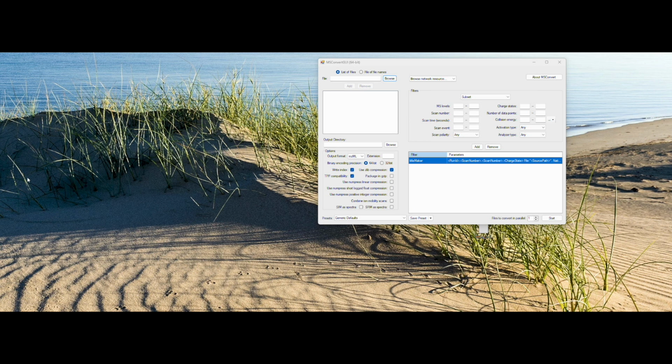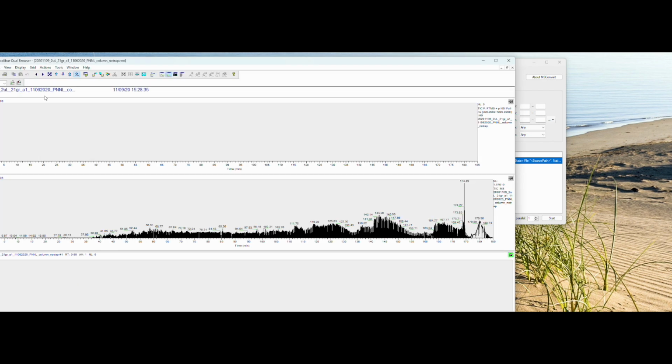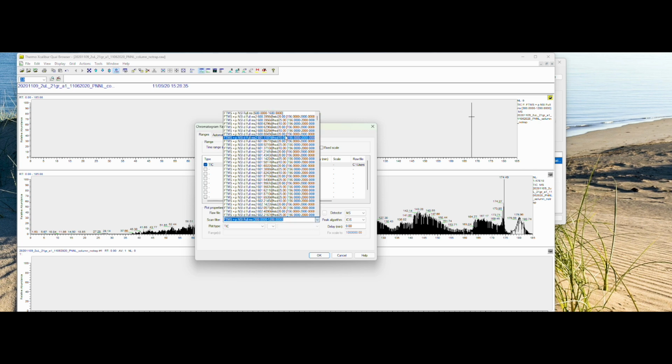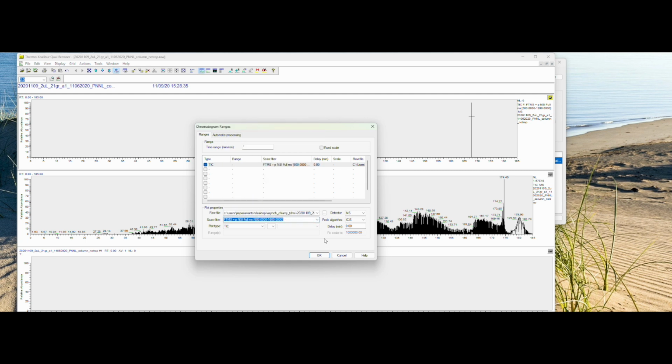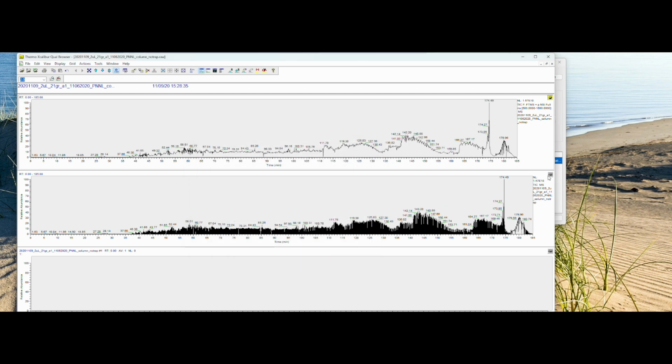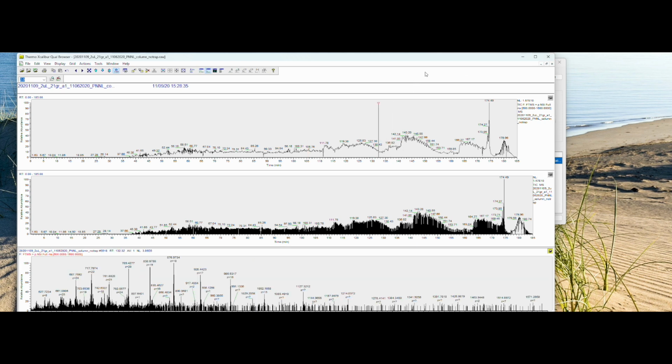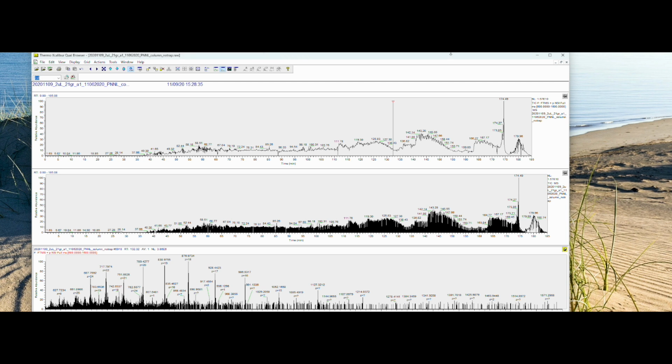So the very first thing, hopefully, that you have is your data. Always take a look and make sure it is what you're expecting. So in this case, I'm just opening up my data. Here we go. Just quickly showing what it looks like.